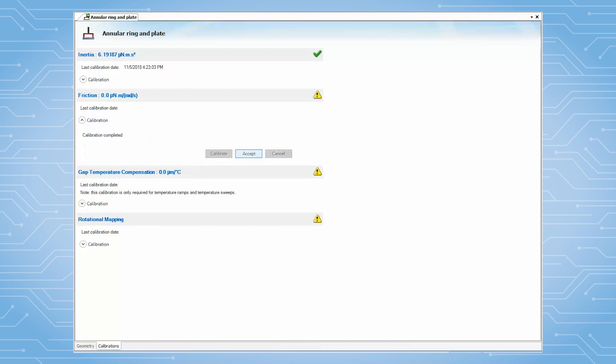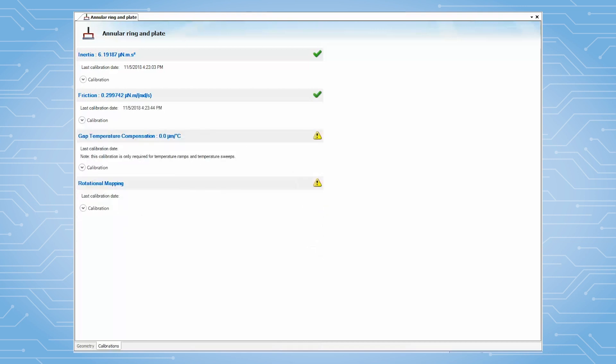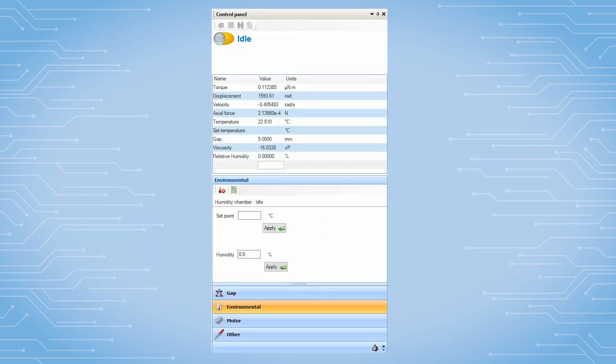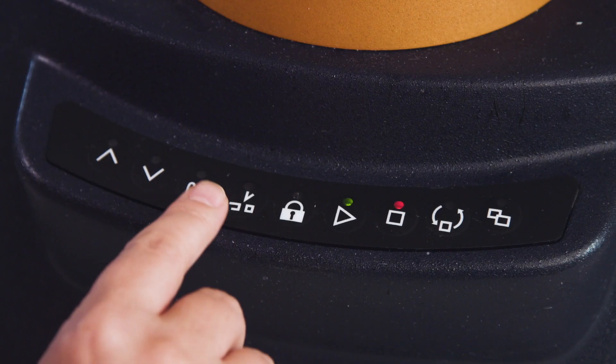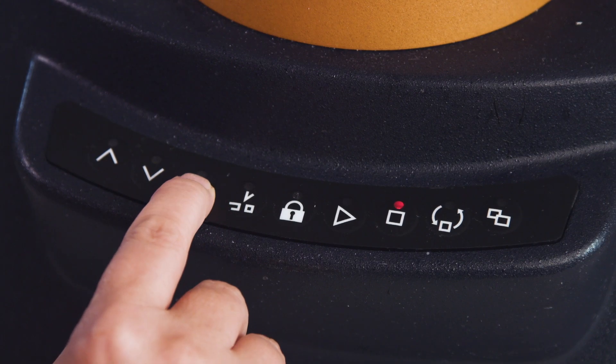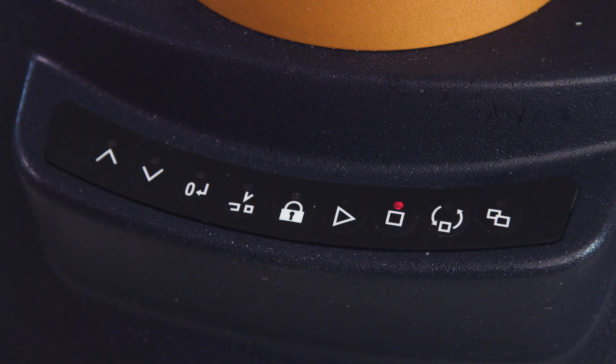Then, close this calibration page. The next step is to precondition the chamber and geometry. Under TRIO's Control Panel and Environment, set up the initial measurement temperature and humidity. After the chamber is fully equilibrated, zero the geometry gap.